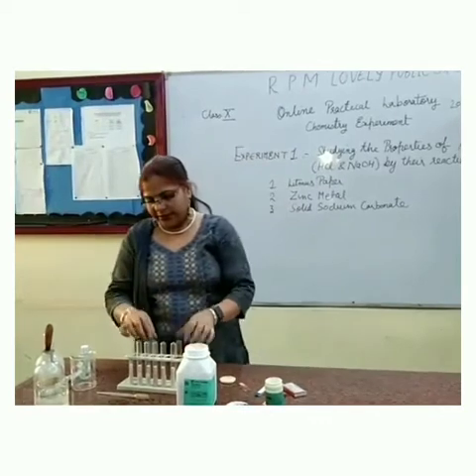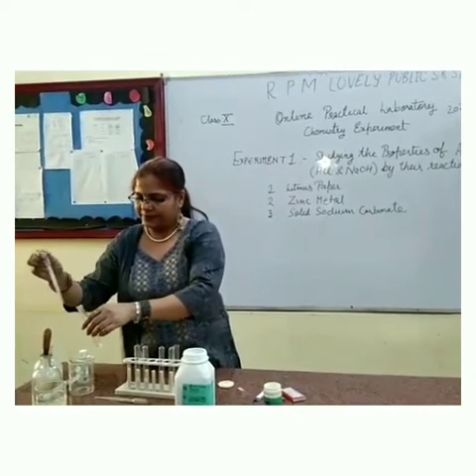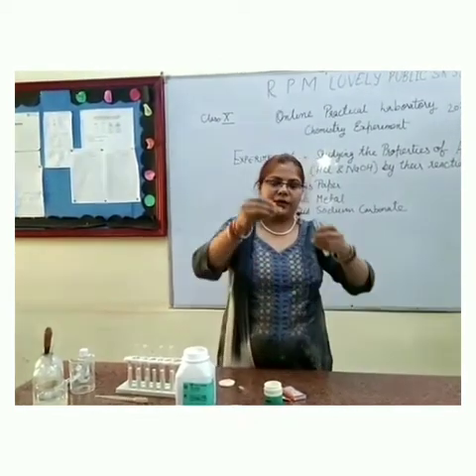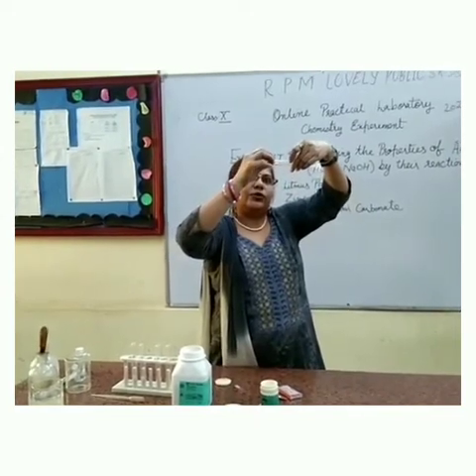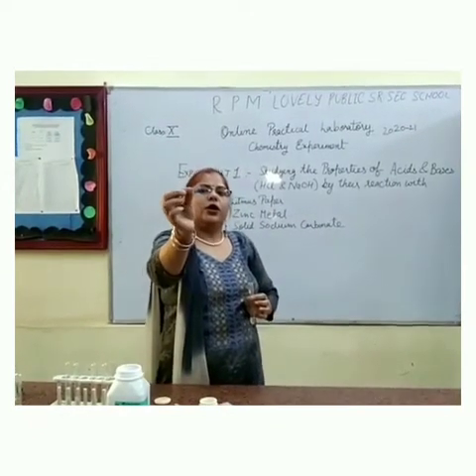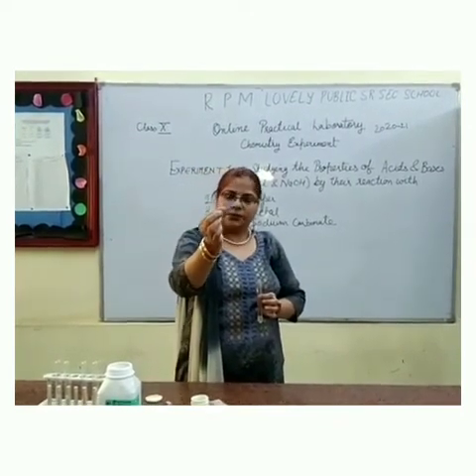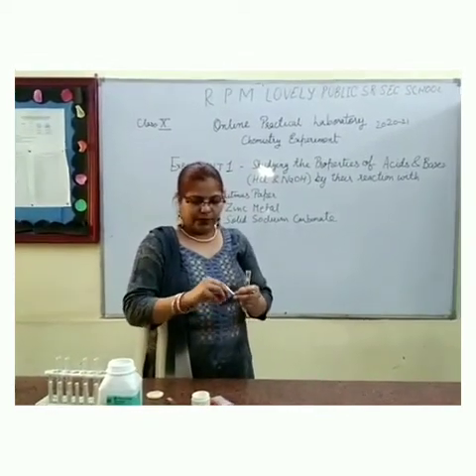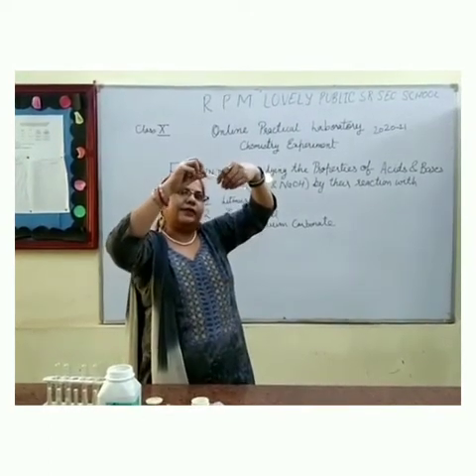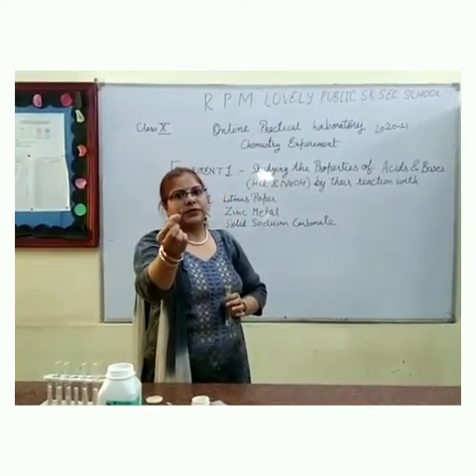Now in another test tube, we will take the base, that is NaOH, and perform the same test. We take the remaining strip of red litmus and put it in the NaOH solution. When red litmus comes in contact with the base, it turns blue. That means bases turn red litmus blue. Now we take blue litmus paper and dip it in the base, and we can see that there is no change of colour — bases do not turn blue litmus, no change occurs.